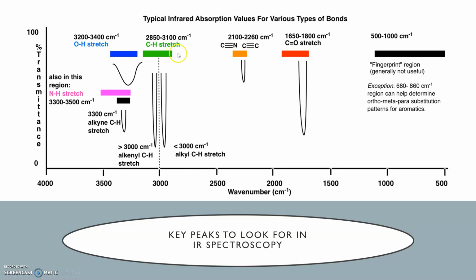It's not one continuous CH stretch, since it's a ring and there are different environments for each bond. So we're going to be looking for short multiple peaks within this range because they are still CH peaks, but within a ring.